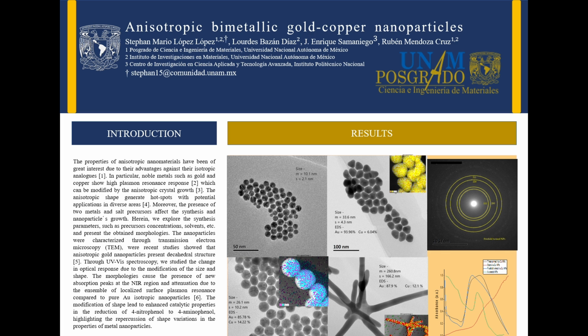In particular, noble metals such as gold, silver, and copper show a high plasmon resonance response. That's why we decided to synthesize bimetallic gold-copper nanoparticles and to characterize the morphologies and the plasmon resonance response through ultraviolet-visible spectroscopy.